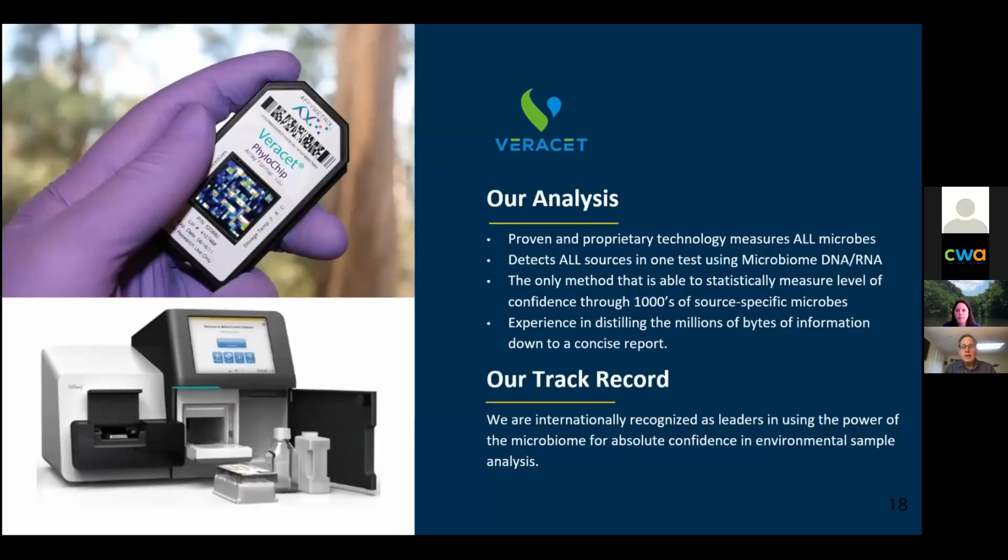Our technology was developed in my lab here at University of California at Berkeley. It uses a microarray based approach to measure all microbes, both by using DNA and RNA. In the upper left corner here, you see an example of an earlier version of what we call a PhyloChip, our microarray method. On our latest versions, we have up to 1 million different probes to detect any of the tens of thousands of bacterial species that could be present in a water sample.